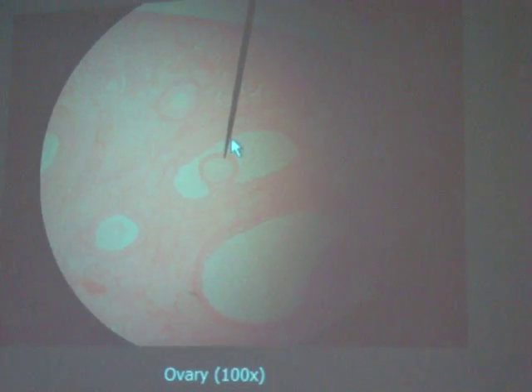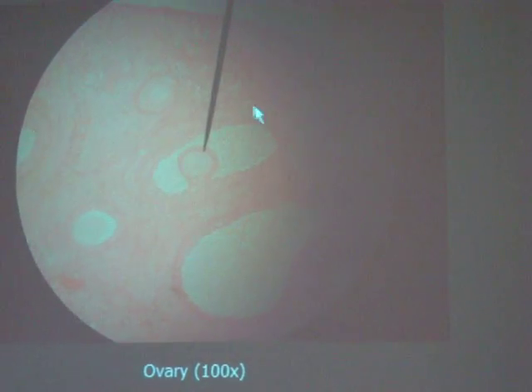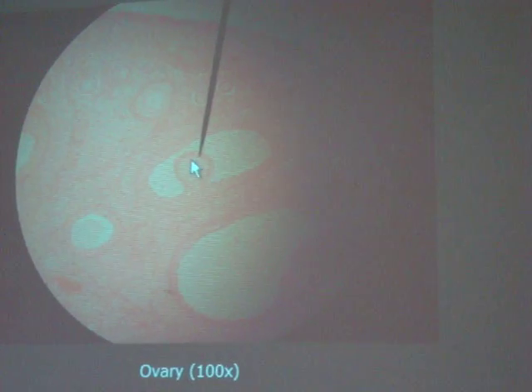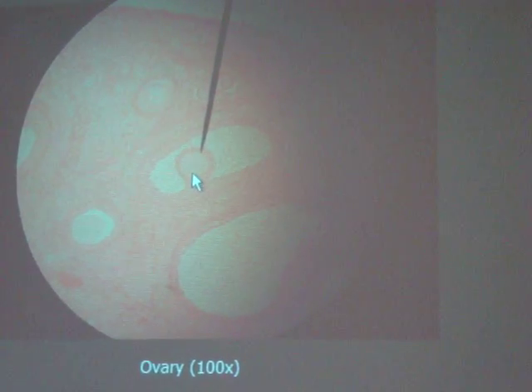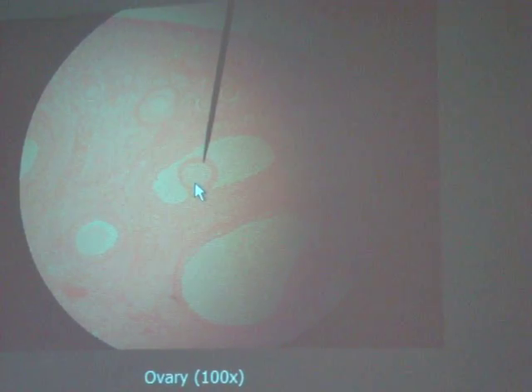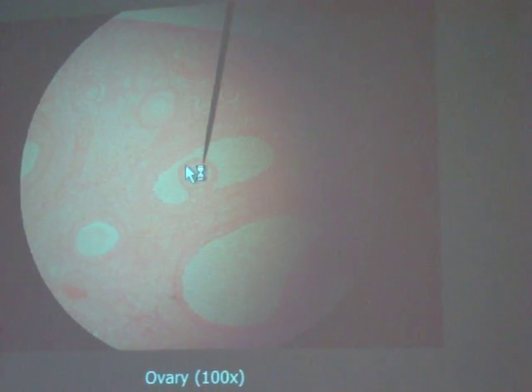Okay. The ovary. Okay, so this is a Graafian or mature follicle. That means the same thing. So what you're looking at, you're going to have this big wide open space, and then the oocyte, which is this right here, sits on a little pedicle or pedestal. You remember what that is. And so that's the way you can tell a Graafian follicle is going to have this big oocyte.